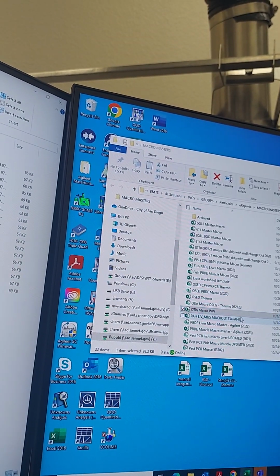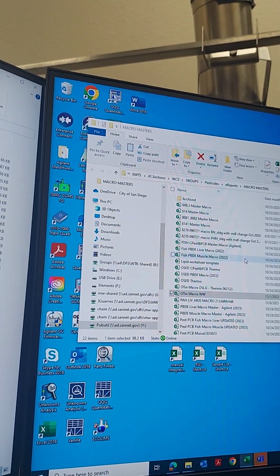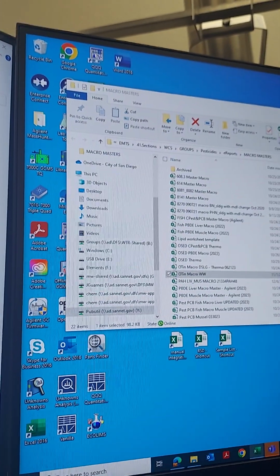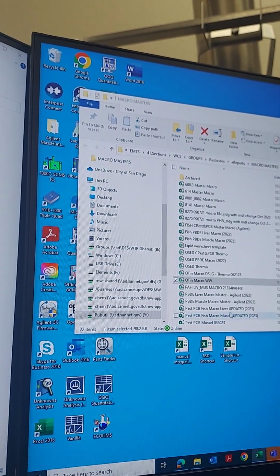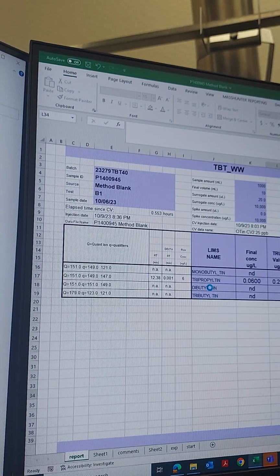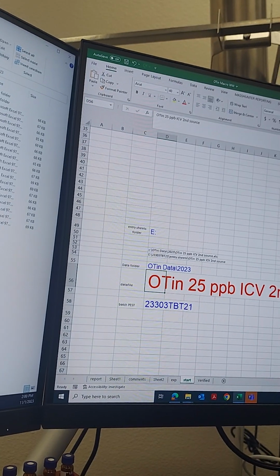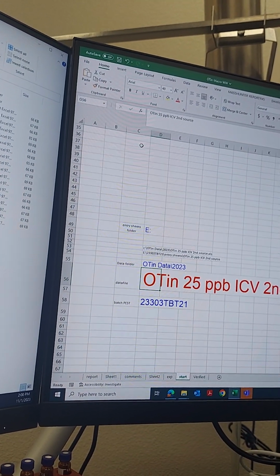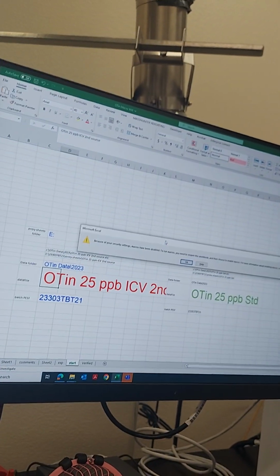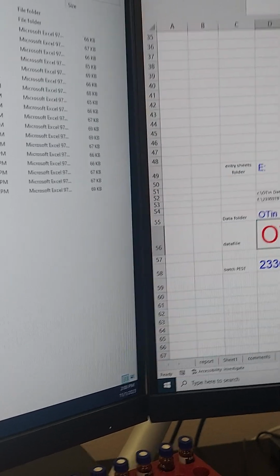Let's open it and enable macro. It says that macros aren't enabled for some reason. Could you try again? Because of your security. Because you have these other macros.